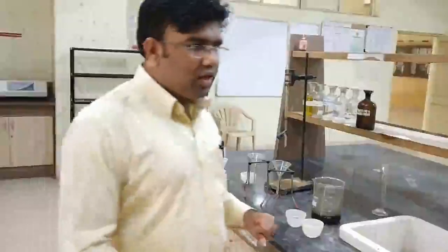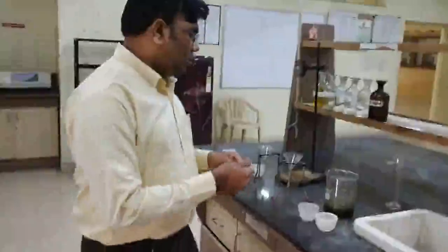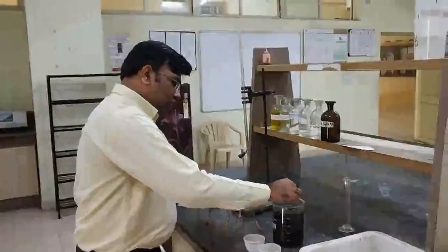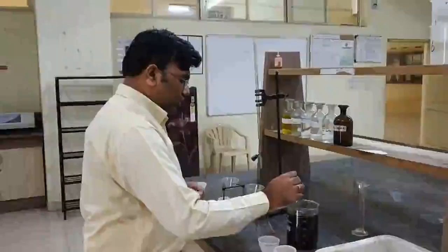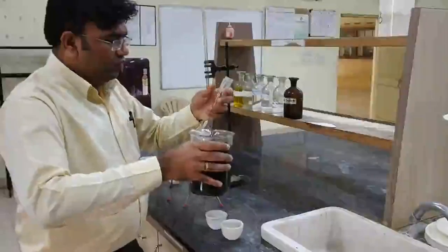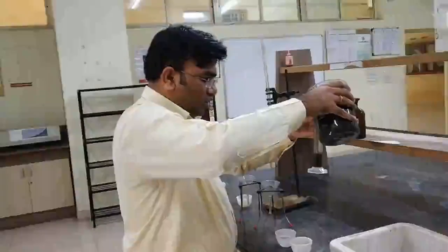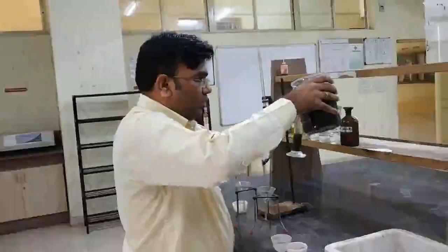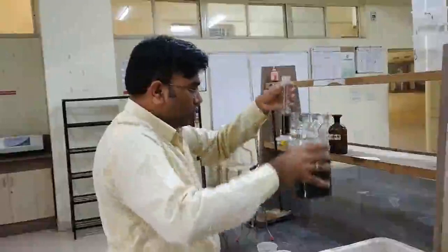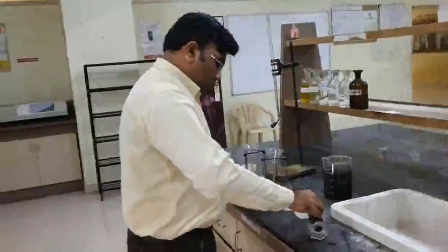Now while taking the sample, we'll have to make sure that it is stirred properly. So we have a stirrer, and we are going to stir the solids properly, and then we are going to put this into the crucible. 25 ml of this sample we are going to take. As the solid concentration is more, I'm going to measure it here. It comes out to be 25 ml. So I put it in crucible B.